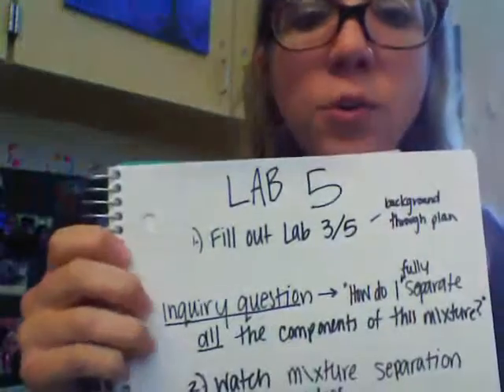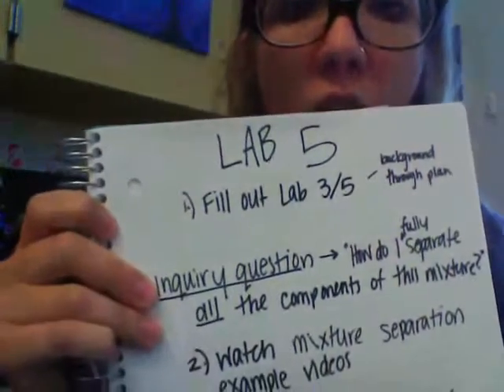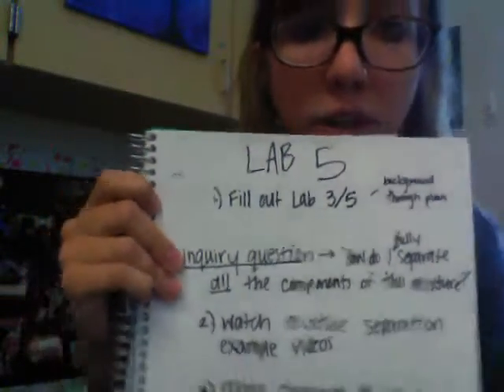Please make sure that you have completed this before the lab. You may not do the lab until you've done this. Your inquiry question I'm going to put right here: How do I fully separate all the components of this mixture? That is what you're trying to figure out with this particular lab.